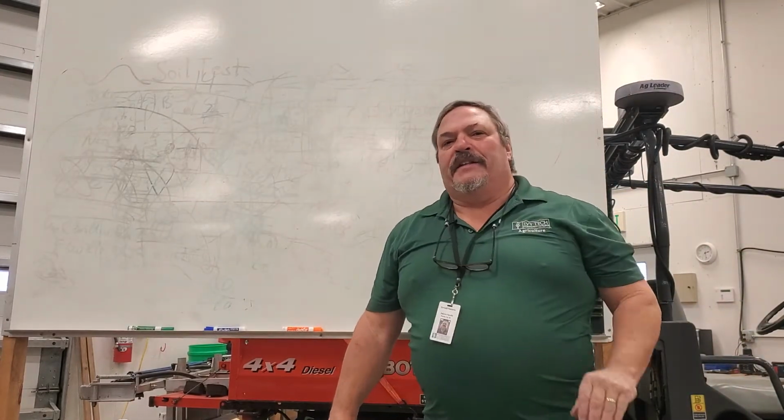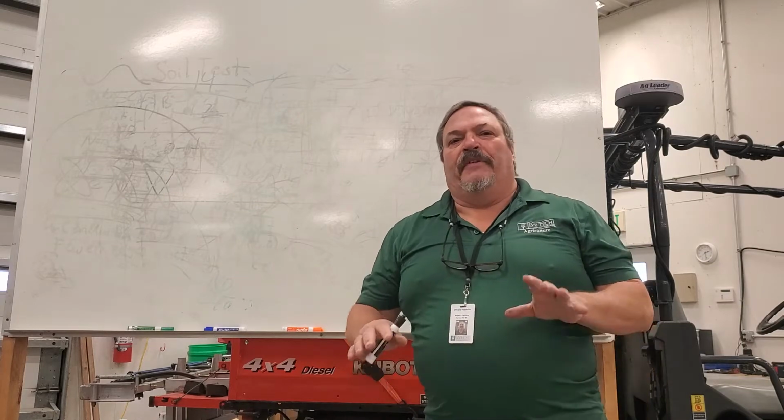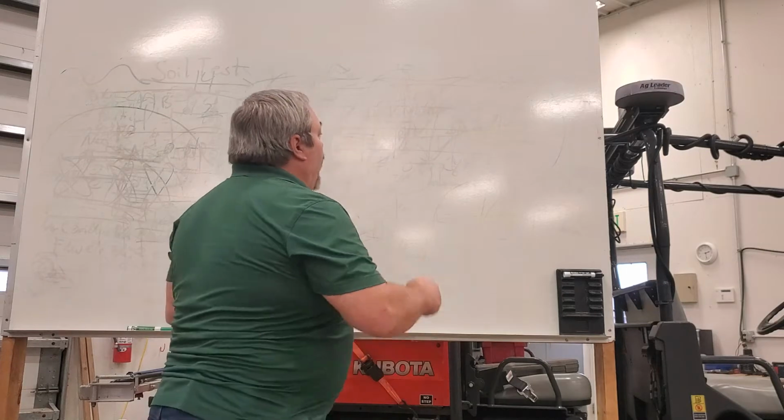It's important that you've already watched the lecture. I'm going to review some key points there and then we'll get into the lab. I'm going to start with our typical soil.